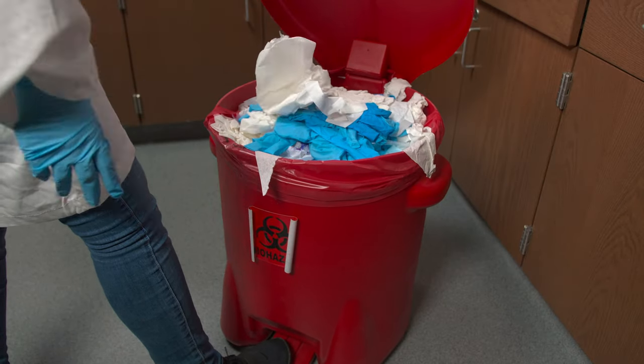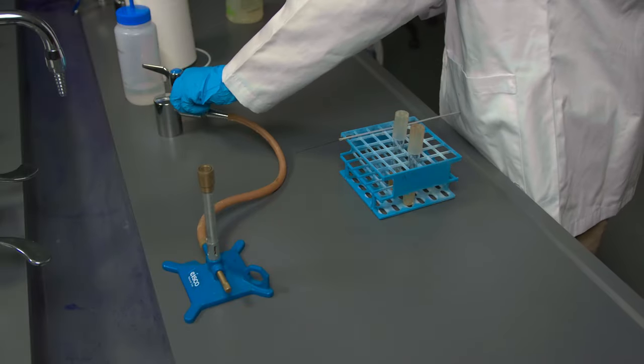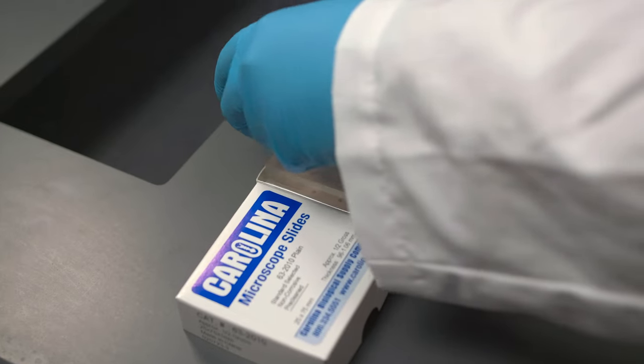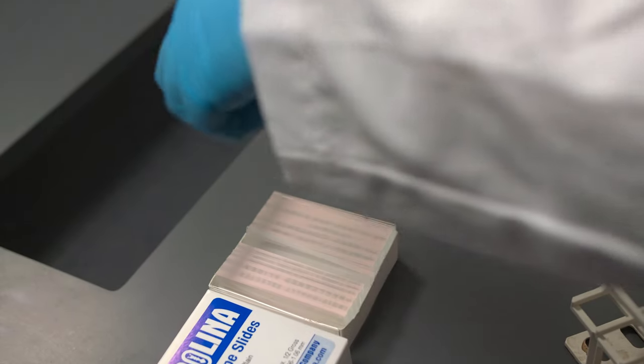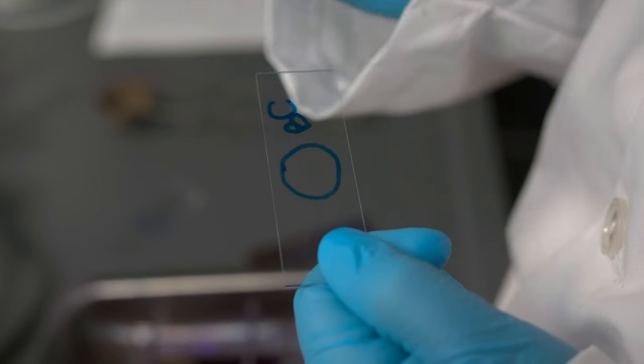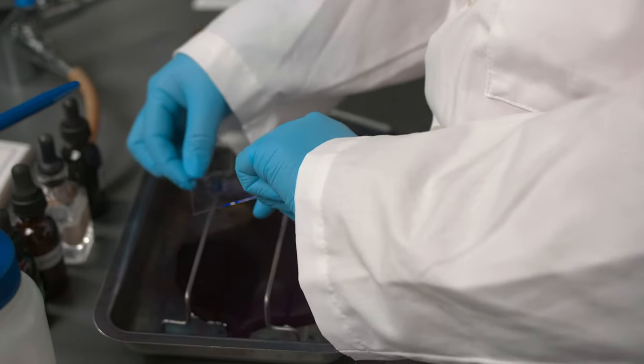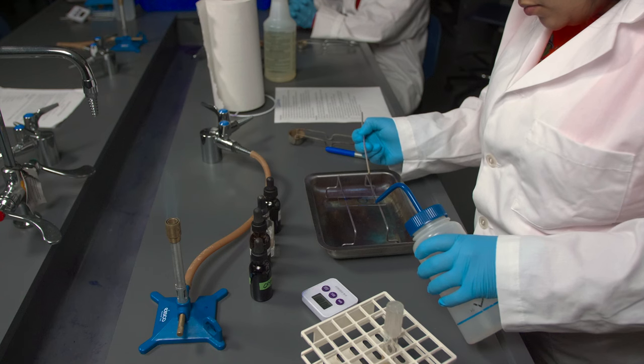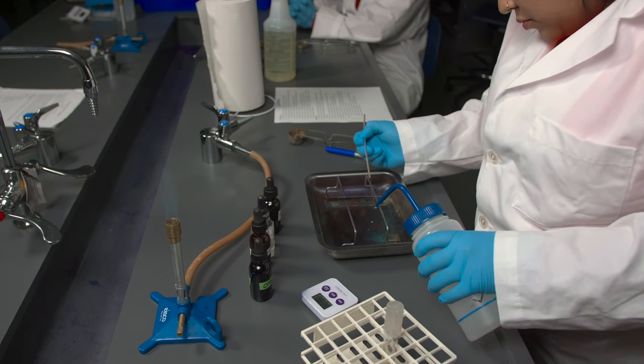let's light the Bunsen burner. Get a clean slide and label the bottom part of the slide. Flame the loop to sterilize it, then put a drop of water onto the loop and apply it to the slide.